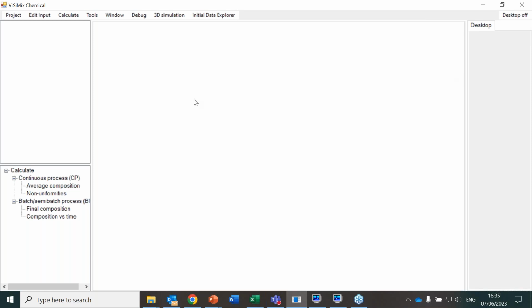In this new platform, we divided the screen into three zones. The first zone will be the projects that will be open. The second zone will be the mixing parameters that we'll be able to calculate. In this product, it will be all regarding chemical reaction in a mixing environment. In this main part of the frame, we will get the response, the solution.